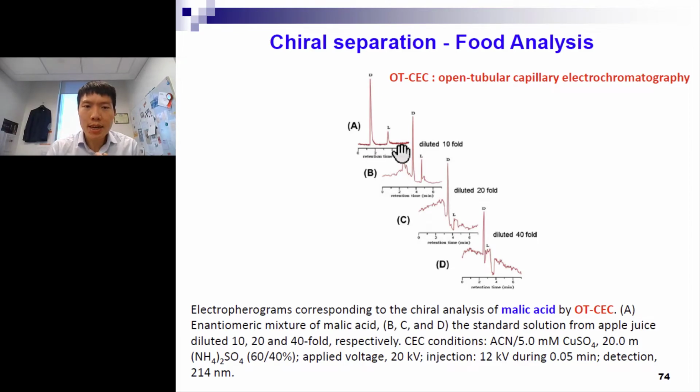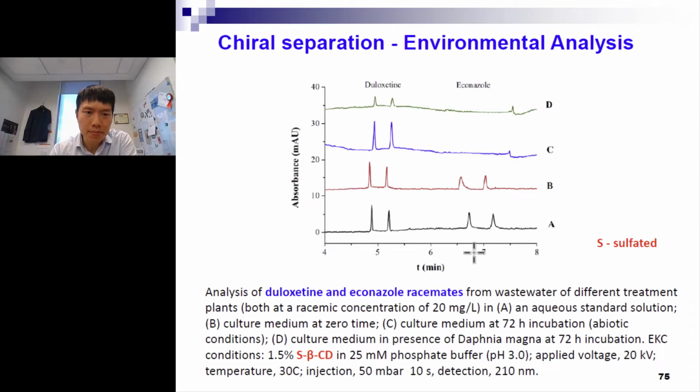What you see for A, without dilution, the signal-to-noise ratio is very good, more than 3, but as you slowly dilute further, you see there was a peak here, then now the peak is like a noise, so we can't even see it. So this is not what we want, but of course we can still do baseline correction later, but it might be less reproducible.